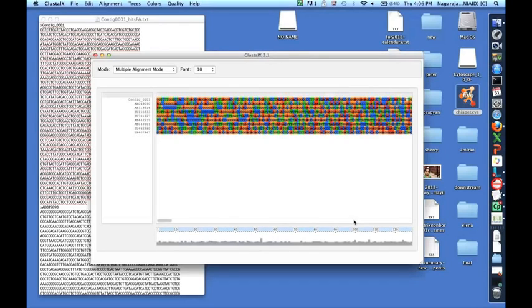After loading your sequences, you will see them in an unaligned state in the ClustalX window. Now would be a good time to check over your sequence IDs and make sure that the process of reading in the sequence hasn't resulted in any identical sequence IDs. If it has, then you'll need to go back to your original data file and remove the characters which have caused this to happen and reload your data.